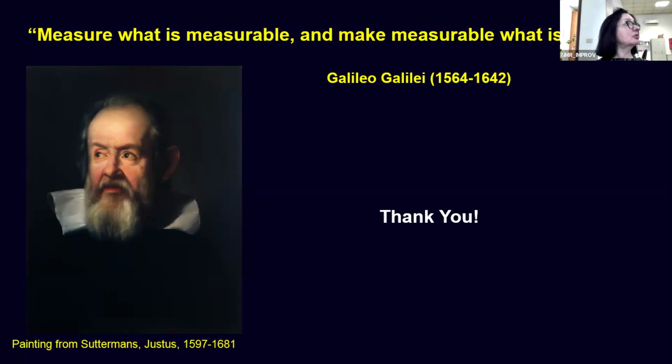Because if I have a curve which does not have many features, I can reproduce it in terms of a superposition of Lorentzian functions, or power law functions, or many other functions. It's just a matter of how many terms I add and how many parameters I have. So I would think that the accuracy of the model, the physical accuracy, the logic of this model would worry me more than the fact that I can be in a local minimum.